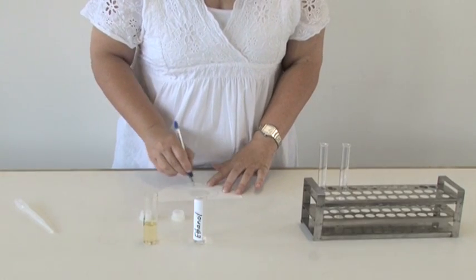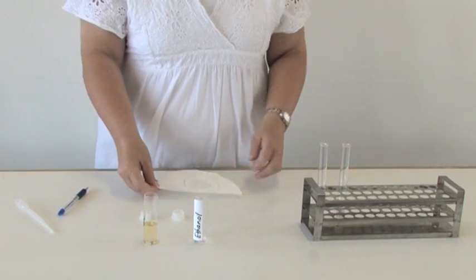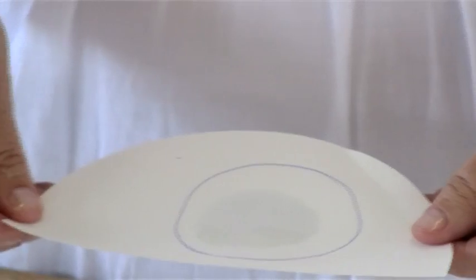You may draw a circle around the wet patch on the filter paper to indicate where the stain would be at this stage.